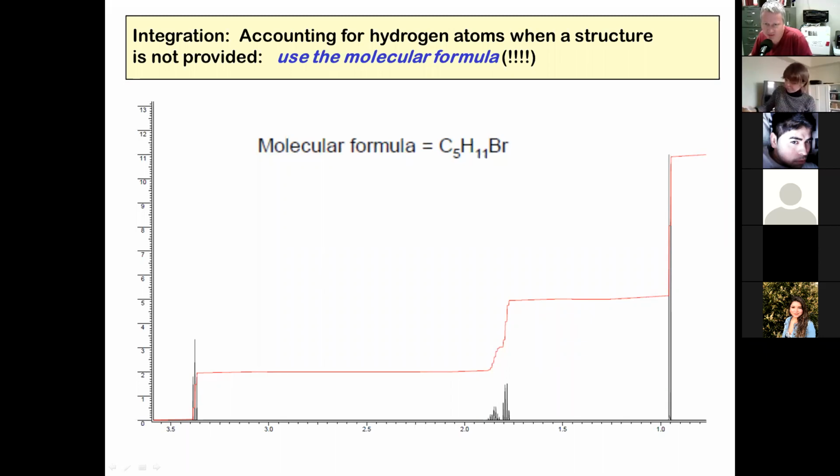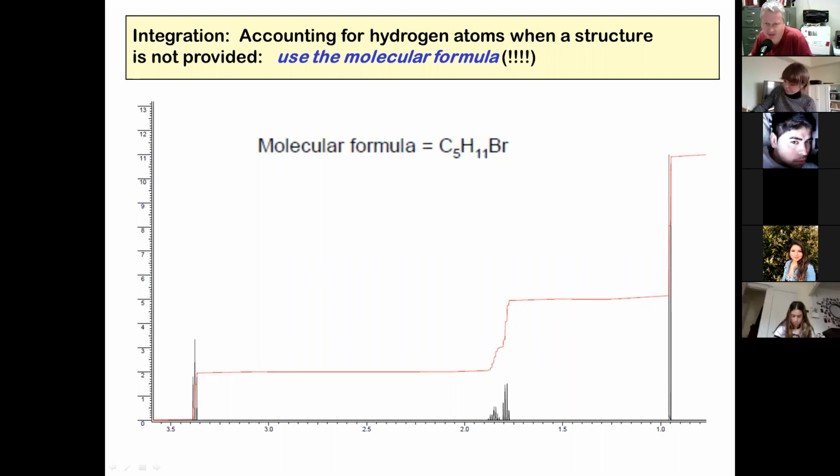Somebody said you can subtract the tallest peak against the smallest peak to derive the amount of protons on each stage. That's kind of true, it just depends. The big thing is just know what am I trying to achieve? I'm trying to achieve 11, right? It's got to add up to 11. If I got something at 1, well, that helps because it's 3s, right? 3, 6, 9, right? So if this is 6, well, then the rest of it makes sense, right?